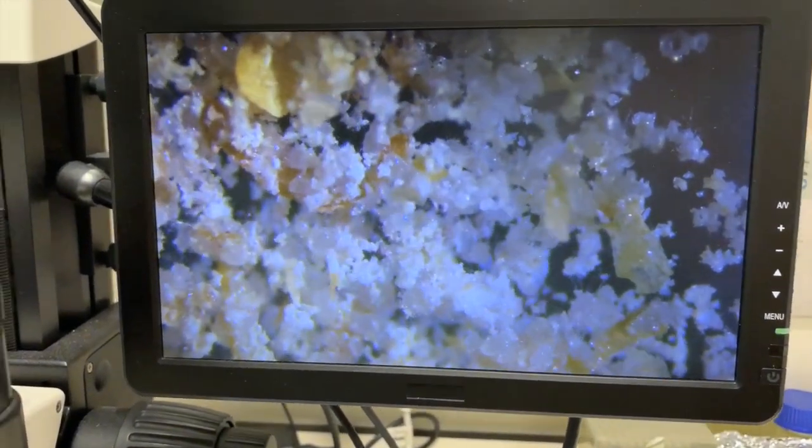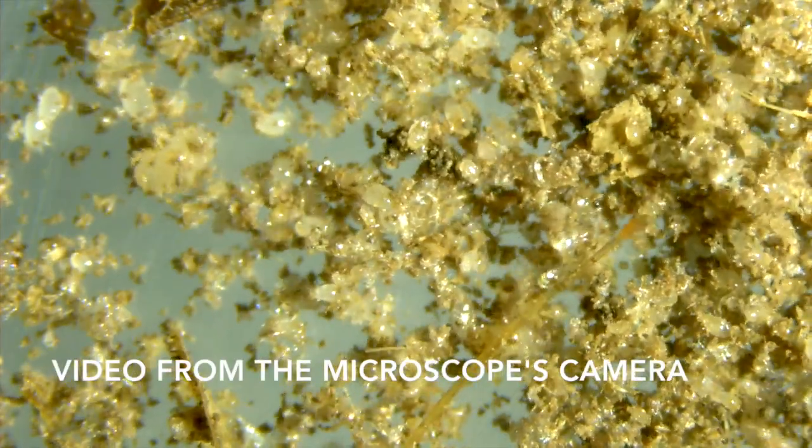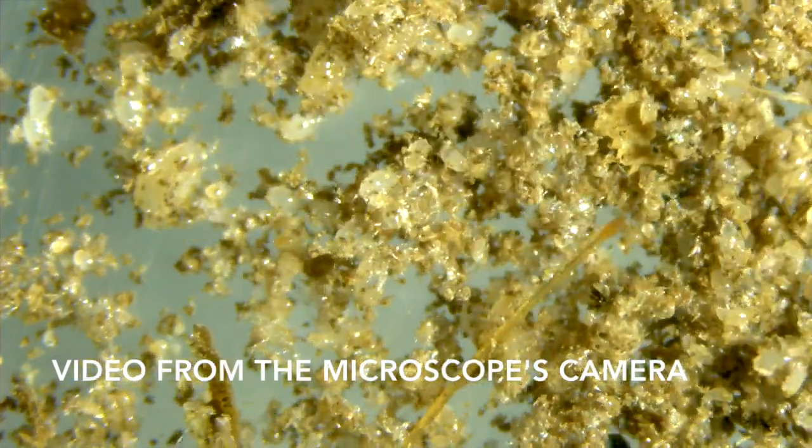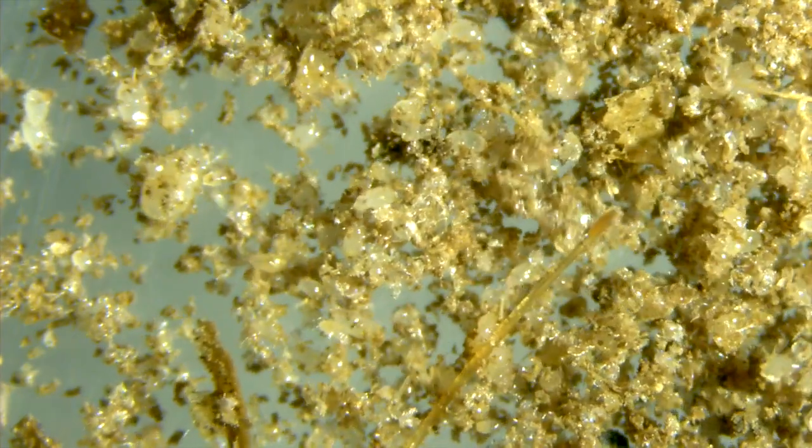So these are all mites walking around. All the moving things — those are the mites. Yes, and the yellow bits are flakes of yeast. And that's what they feed on.